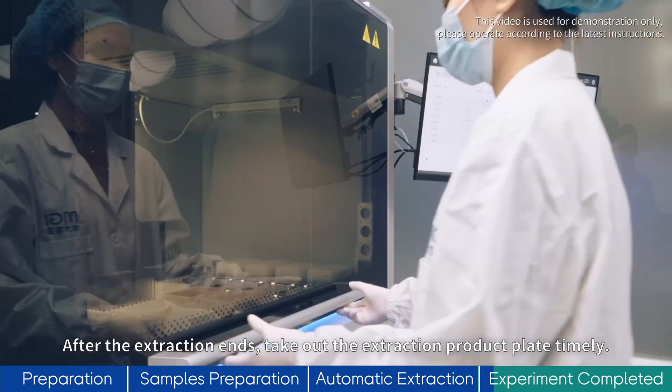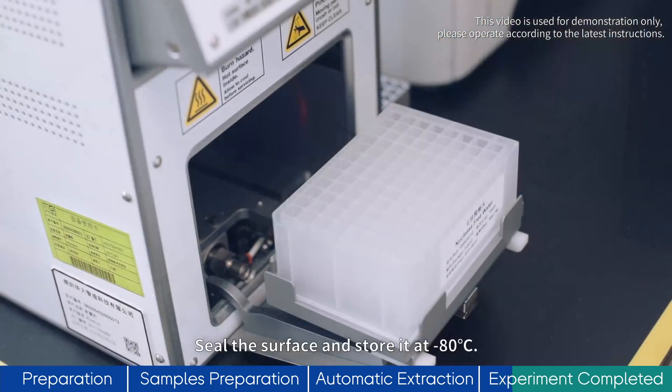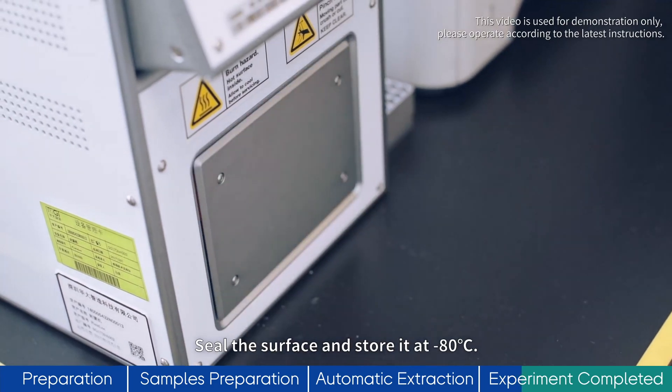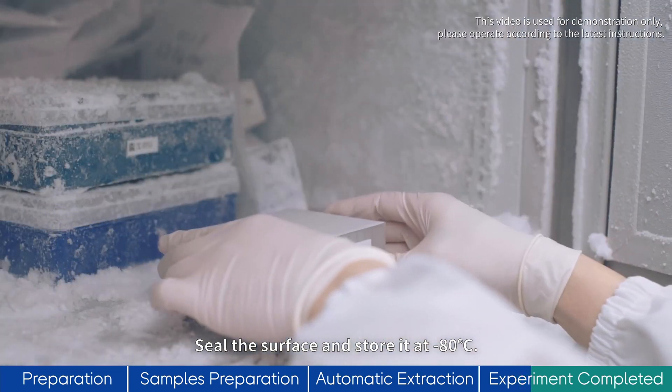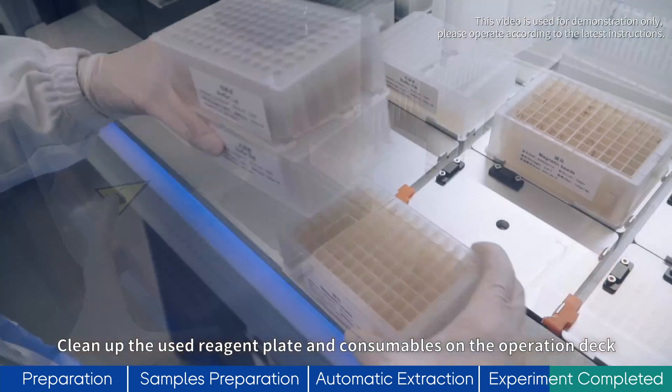After the extraction ends, take out the extraction product plate timely. Seal the surface and store it at minus 80°C. Clean up the used reagent plate and consumables on the operation deck.